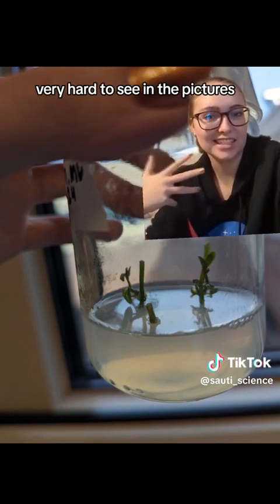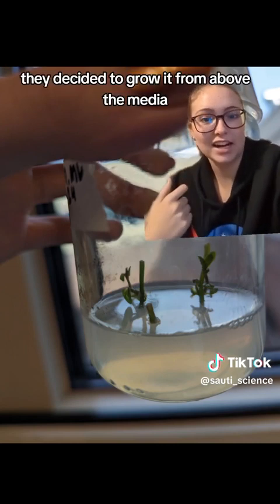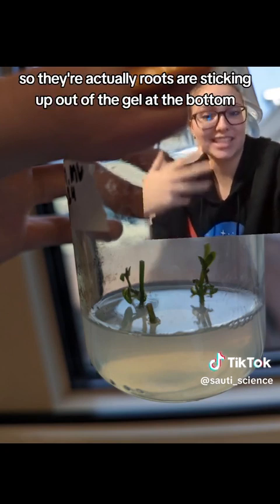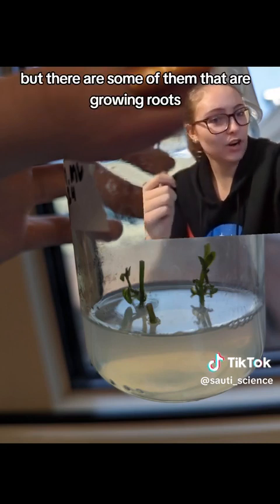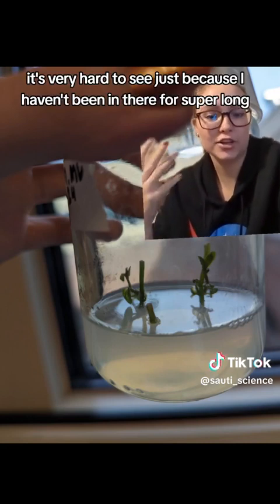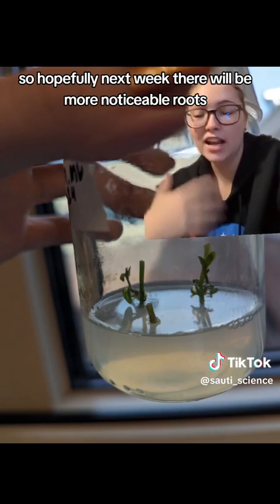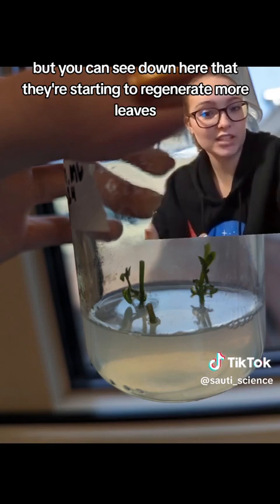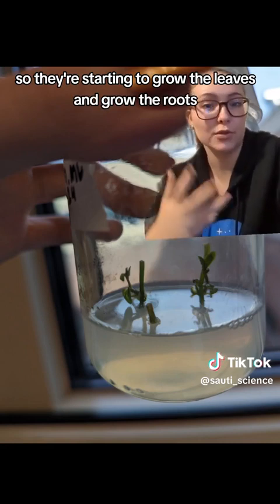It's also very hard to see in the pictures, but a couple of these samples are growing roots. For some reason, they decided to grow from above the media, so the roots are actually sticking up out of the gel at the bottom. Hopefully they'll get their direction properly and go down into the gel where they're supposed to be. You can also see that they're starting to regenerate more leaves because they have access to all the nutrients in the media, so they're starting to grow both leaves and roots.